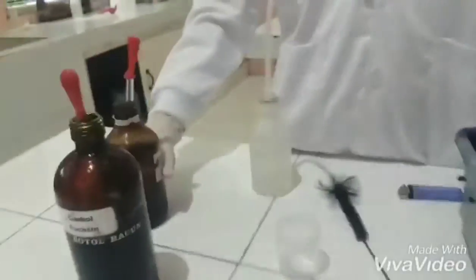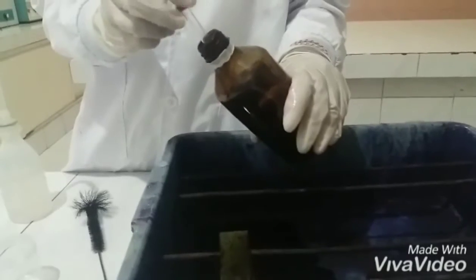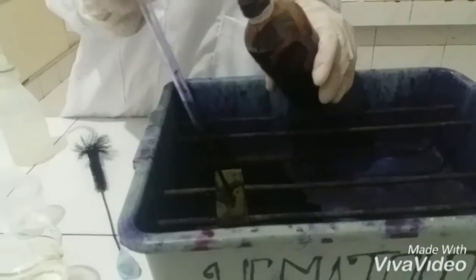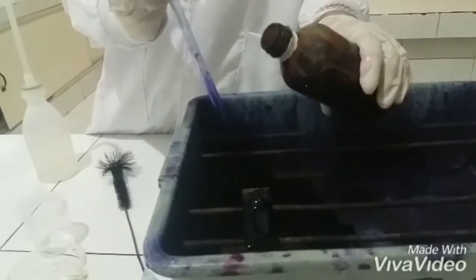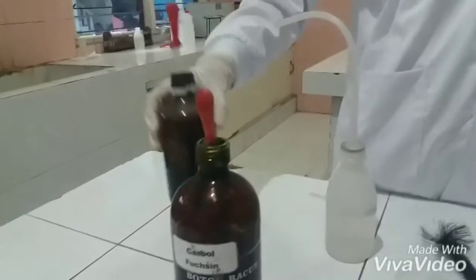We add methylene blue, like this, for 2 minutes.